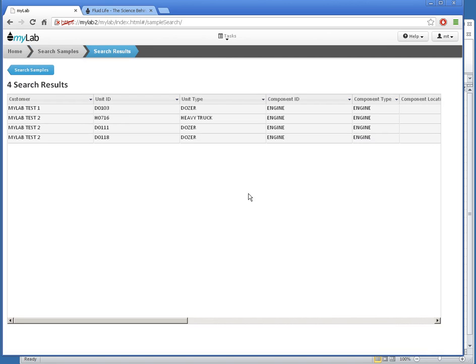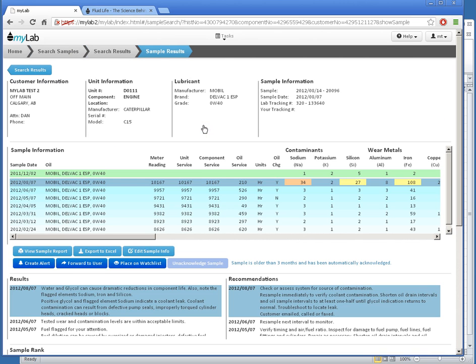I now get a spreadsheet of the results that match. I can click on a row to go look at the details. To go back to the search, I use the Back button.